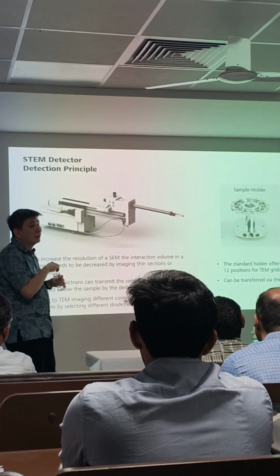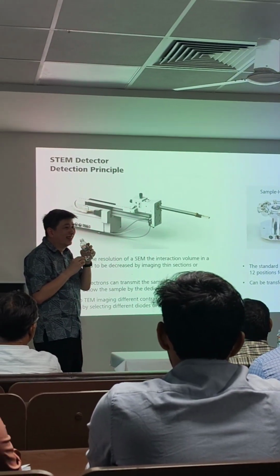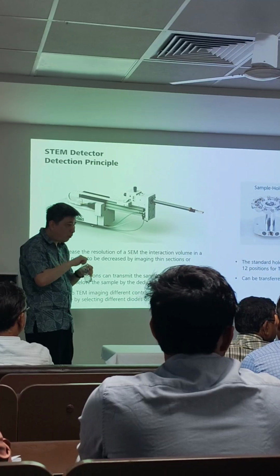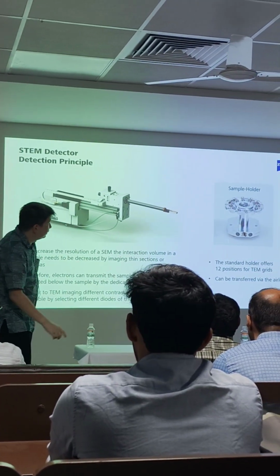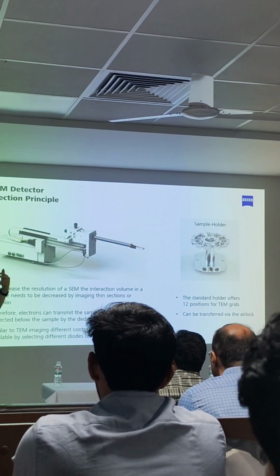How many? 12 samples. Very cheap, right? The cost? We have the STEM mode, right? Yes, we have this holder. The detector also. We have a lot of types of sample holders. We can do it a lot of times.